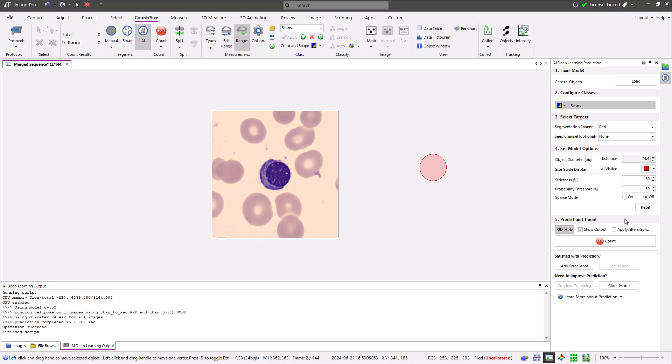This process is likely to be something you do infrequently, as many objects can be found with existing models provided that the settings in the prediction panel are correct. For this I refer you to our training video describing object segmentation and cell pose models.